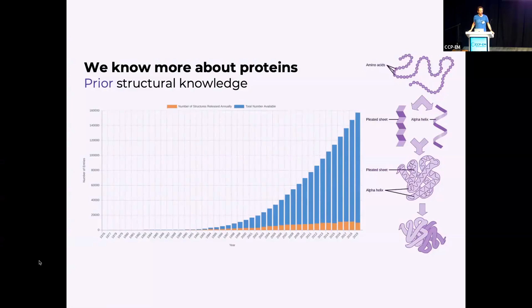So that's where we resorted to machine learning methods. We'd previously shown using simulated data that you can do this. You can make denoising neural networks that act within the iterative loop of Relion to incorporate prior knowledge about proteins, thereby making reconstruction better. Now, that was about 3 years ago or so. And since then, Dari has been working very hard to try and make that work for experimental data.